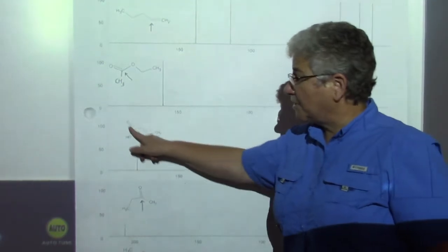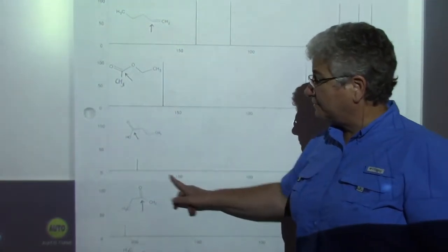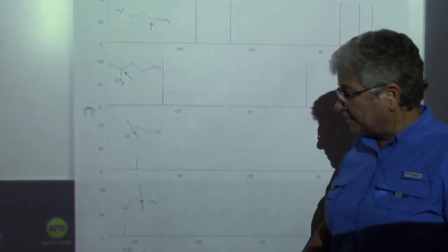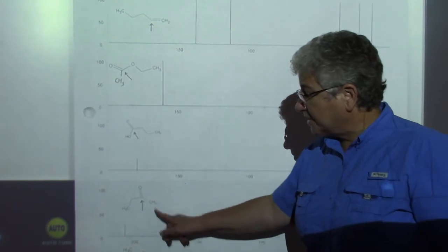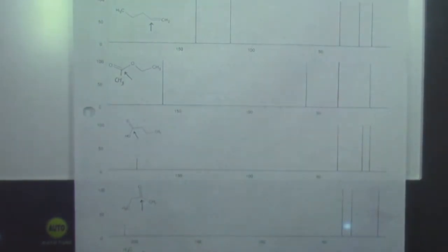The carbon of the carbonyl in the carboxylic acid right below it is again above 150, around 180 or so in the acid, and then you have a ketone and an aldehyde. You will notice in those last two examples that the carbonyl of the ketone and the carbonyl of the aldehyde are both peaks above 200.